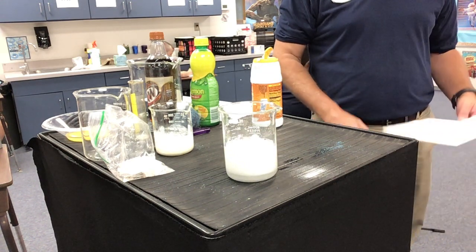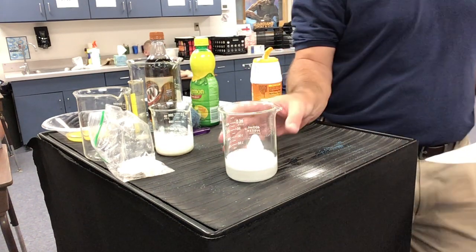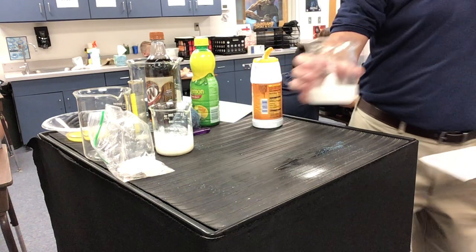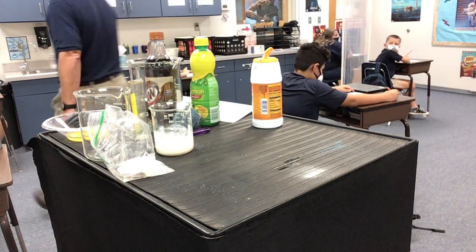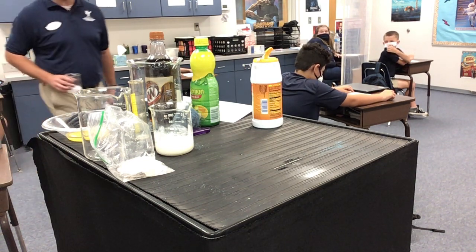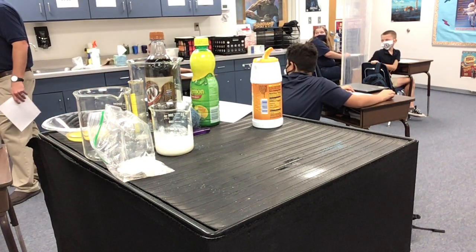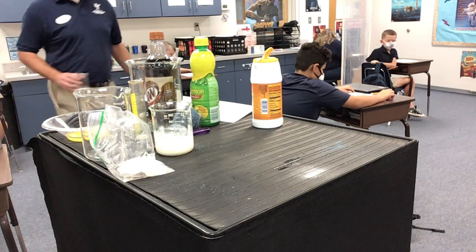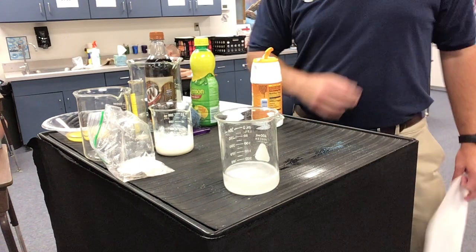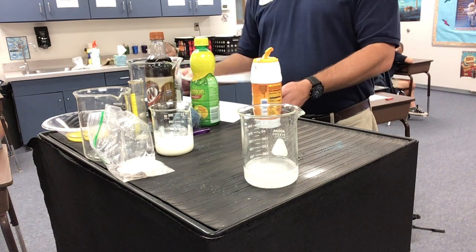Did it change color? Did it bubble? Is there a smell to it? Other than vinegar, does this smell like anything different? Nope, smells like vinegar. Did it change temperature? Is it getting hotter or colder? Nope, okay. What physically changed? What can you tell me? Is it a physical or chemical change? And why do you say that?